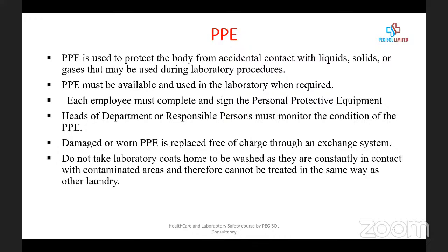Each employee must complete and sign the personal protective equipment record. So there must be an SOP or a log that shows and describes PPE for your lab or for your organization. Heads of department are responsible for monitoring the condition of the PPE, to know whether they are fit and still in good shape to be used. Please note that damaged PPE is replaced free of charge through an exchange system. In other words, staff are not to pay for the PPE they use to do a particular process.